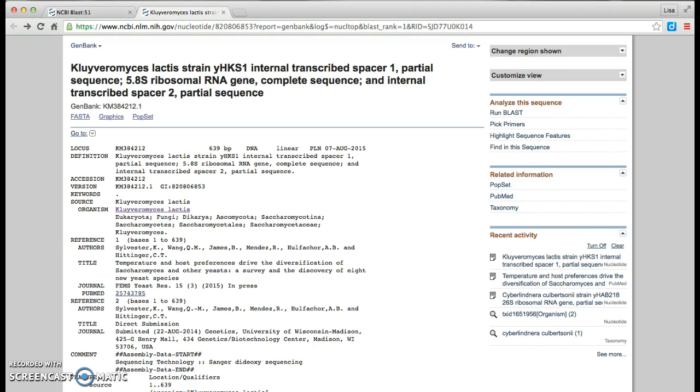And there you go. You can take a DNA sequence and figure out its species. And when you're investigating microbes and how untapped that whole microbial world is, you just might not get a hit. And that can be just as exciting. Maybe you've discovered something that hasn't been discovered before. So carry on, scientists. Remember, drink milk, read books.